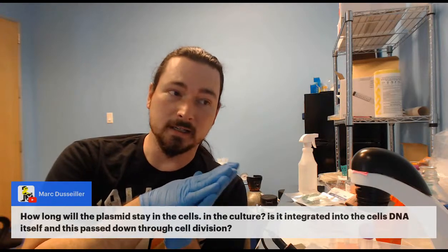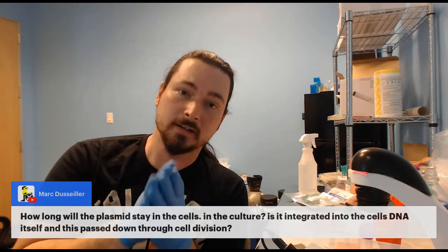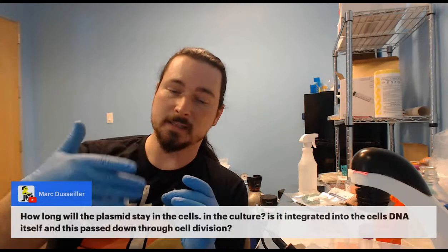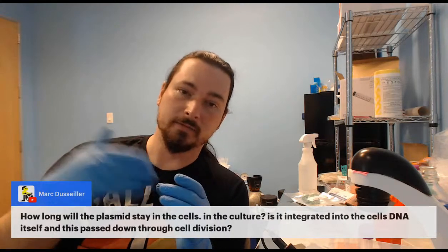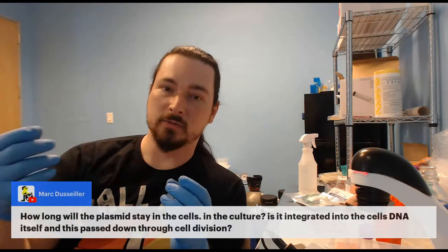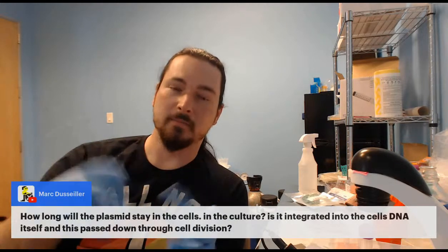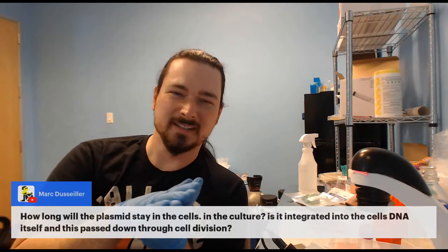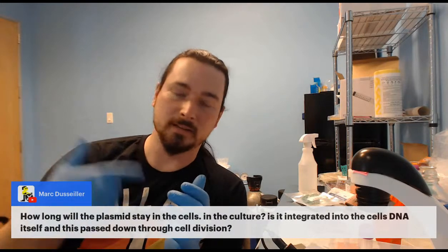You can just keep selecting really hard and aggressively. And what happens is, as the cells divide, yes, it's diluted, but you'll still have some cells that have the G418 resistance. Those cells will survive, and those without it will die. And so you'll end up just constantly selecting for it, but it will make it much harder for your cells because they're not like bacteria that can just replicate the DNA.